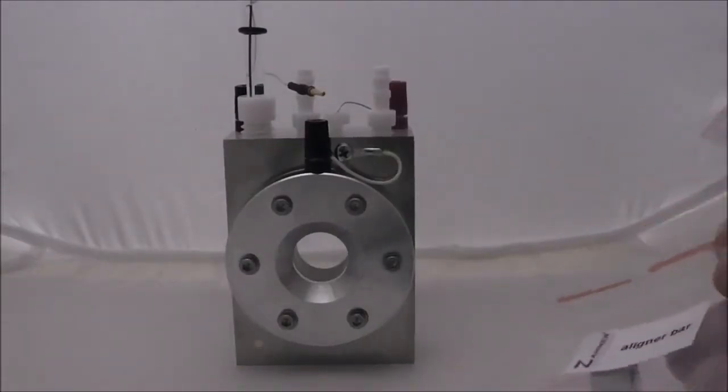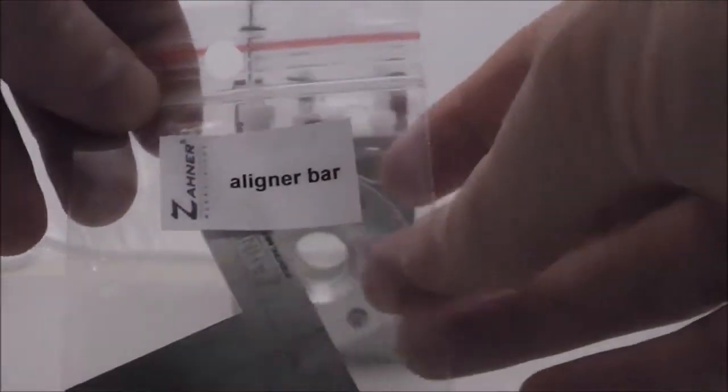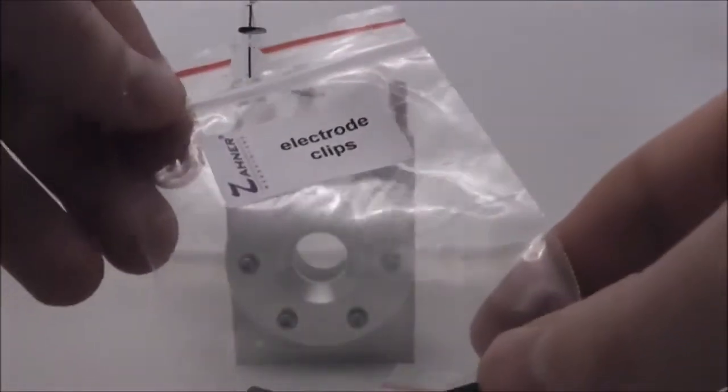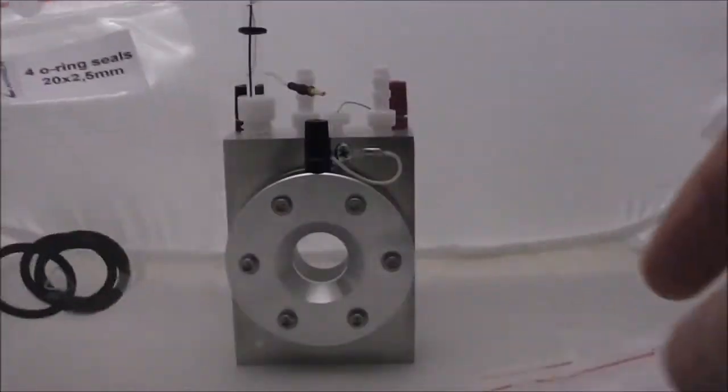The nice thing about Zana is when they ship you the PEC2 cell, they ship you a whole host of accessories, including alignment bars if you need them, alligator or crocodile clips, and extra seals.